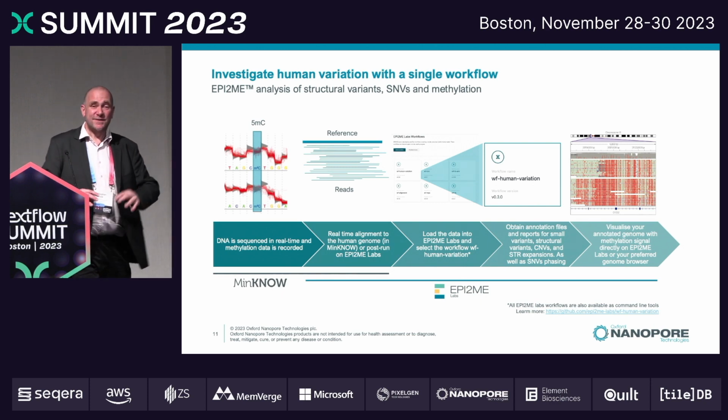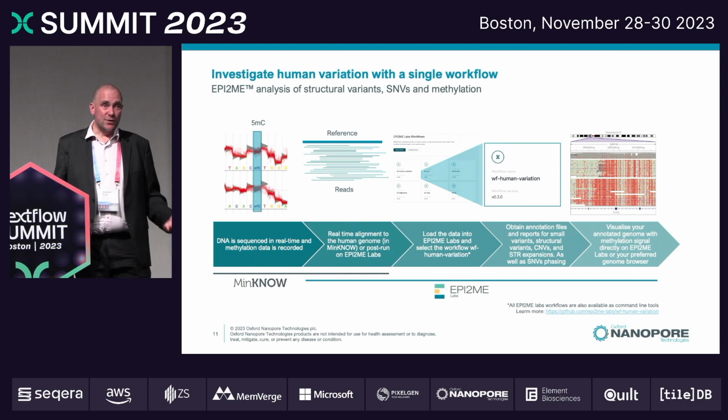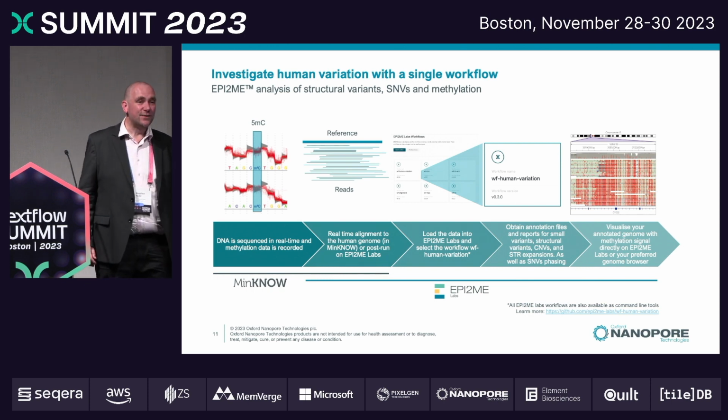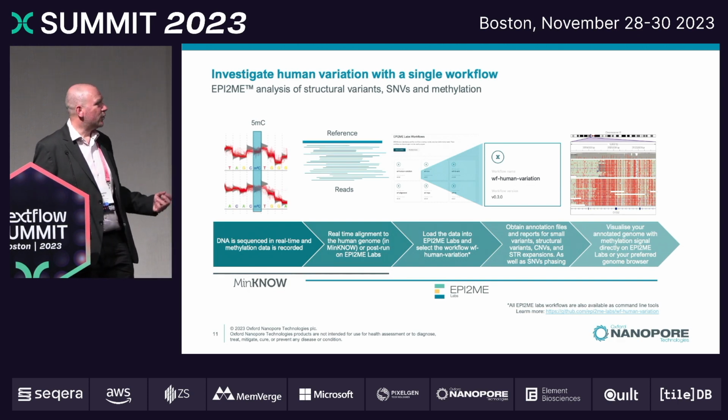we've got loads and loads of different genetic variation. So we want to have an integrated workflow where, of course, you start off with your sample, you sequence, the machine goes ping, click on the button, you process the data, and then you have the collection of variant files. You've got the methylation data. You can come up with all sorts of magical, colorful plots. You have the ability to understand what is the etiology of this rare disease, what are the particular functional variants that we should be characterizing or segmenting.